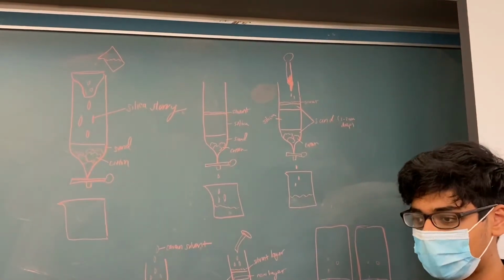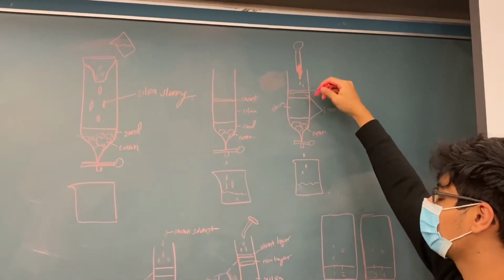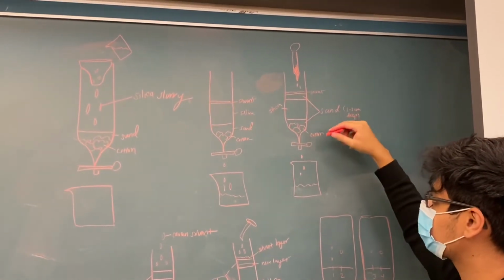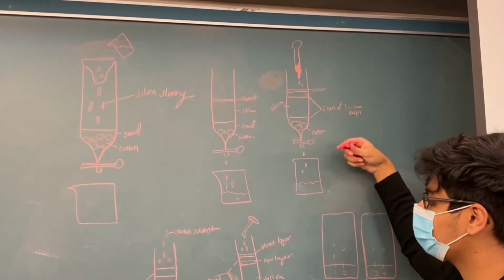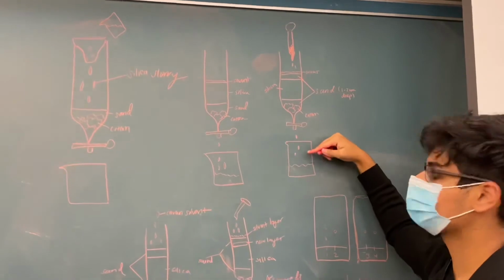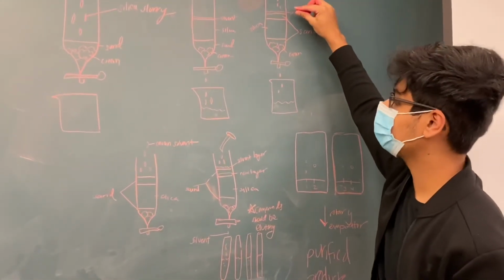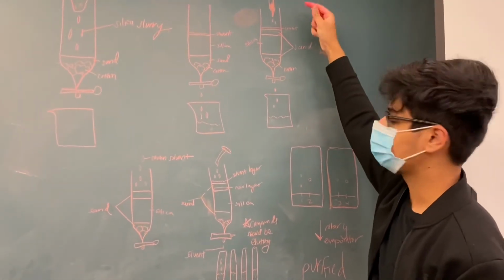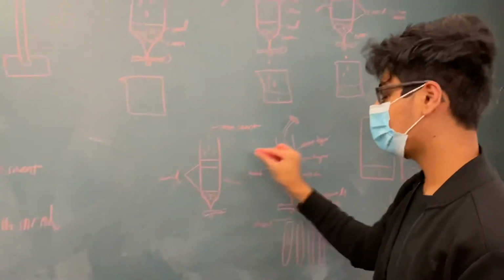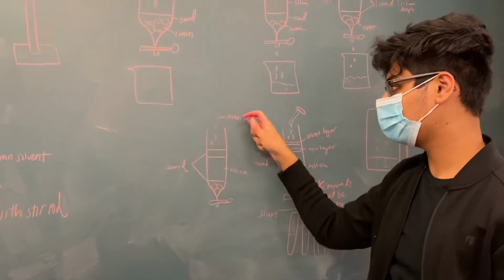You can use the glass pipette and pour your required amount of sample onto the reaction column. Once that's going, you turn on the stopcock and start draining all the solutions, and you should see the samples dripping down. Then you should see just a little bit of the sample and solvent intermingling and going into the sand. After that, add a little bit of the column solvent, and then you let it go through.